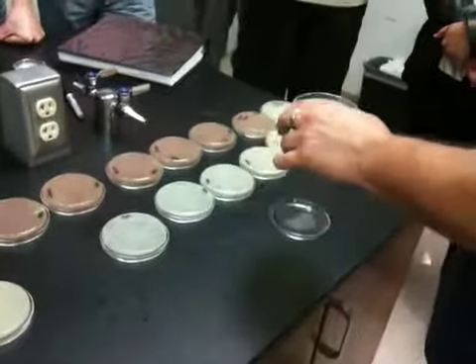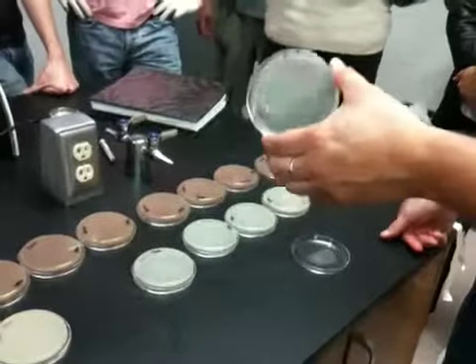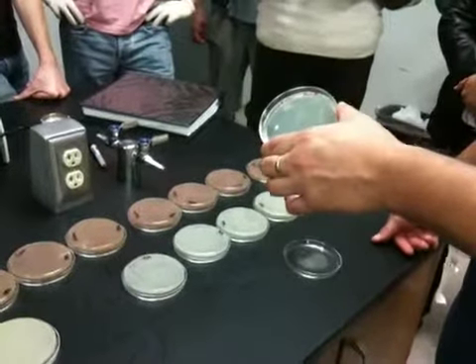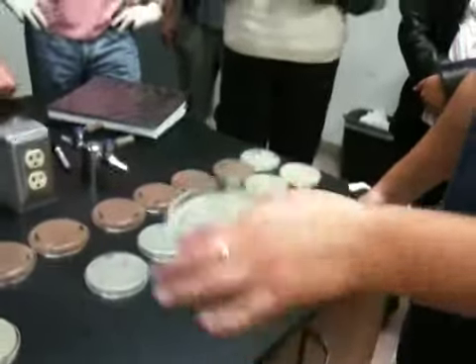Tell me. After the fact. After the fact, yeah. It is a bacillus, so what else could have caused it? It had an endospore, and the endospore was refractive to the UV, and so it just grew afterwards.